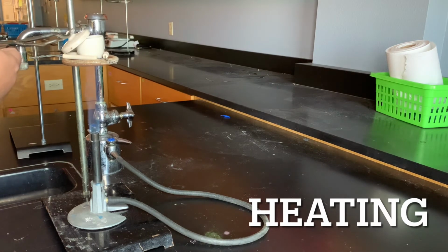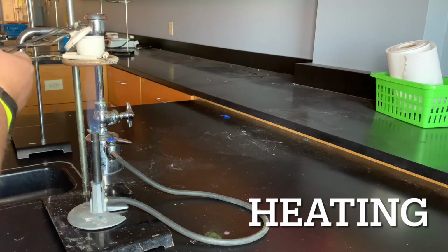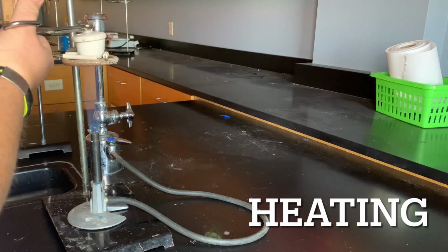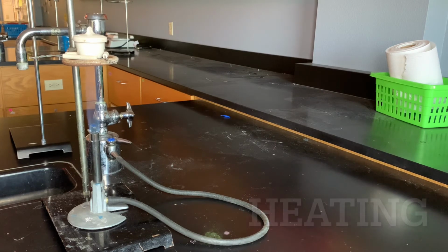Okay. Sometimes we want to cap our crucible to build up some heat. So we're controlling the heat with the lid. So you may want to partially have it on there, or you may want to have it on there completely. That is you and your team's decision on how you want to do it. But we're going to heat the substance. Then we're going to cool the substance, heat it again, and cool it again. And then once it's all cooled, we're going to weigh again.